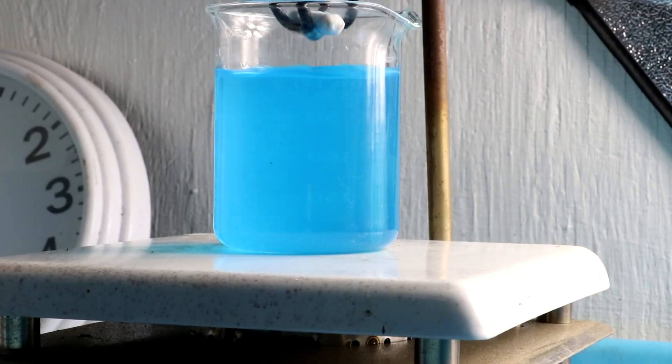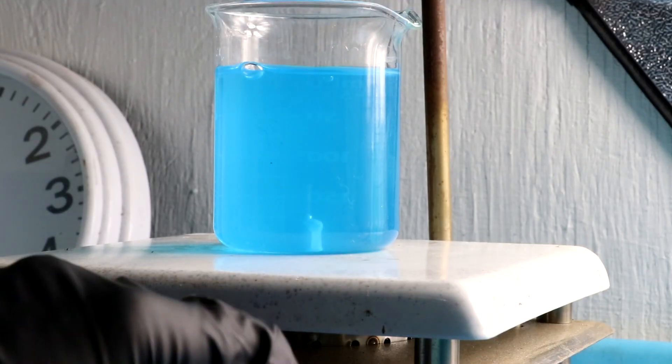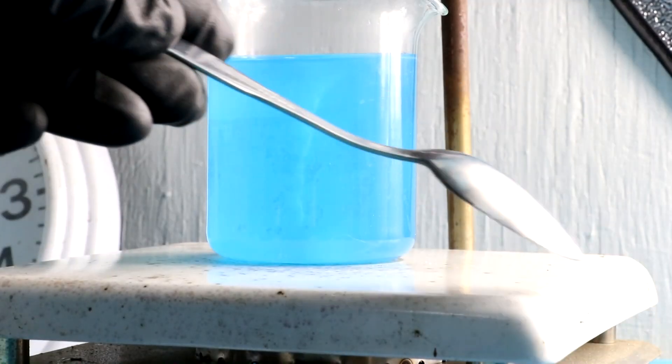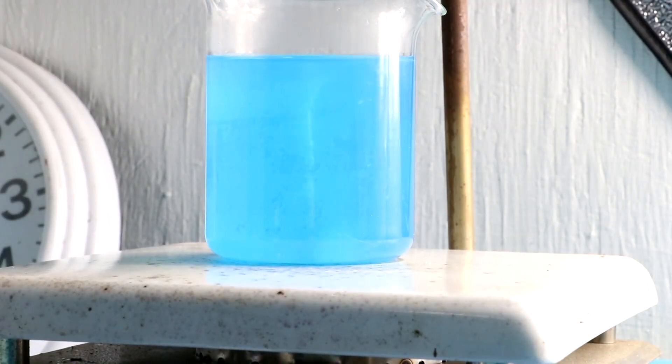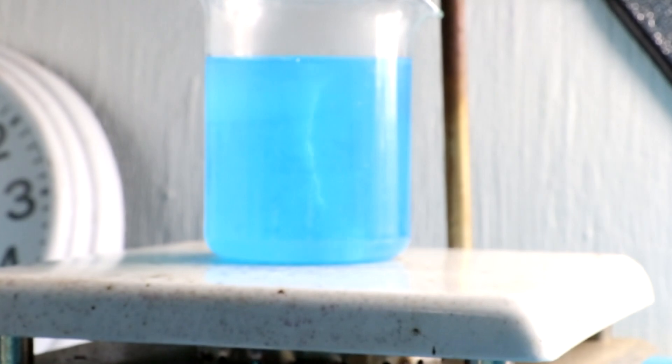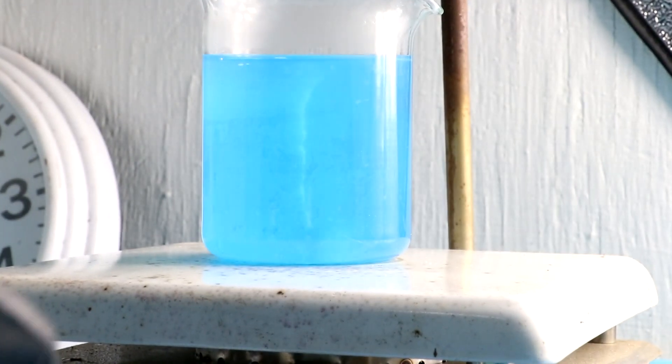Apparently this stir bar is too big. There we go. So now we have a solution of copper sulfate. This is copper which has given two electrons to the sulfate ion to form a water-soluble compound. This is copper in the plus two oxidation state.